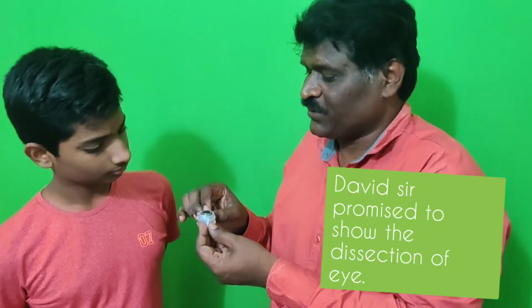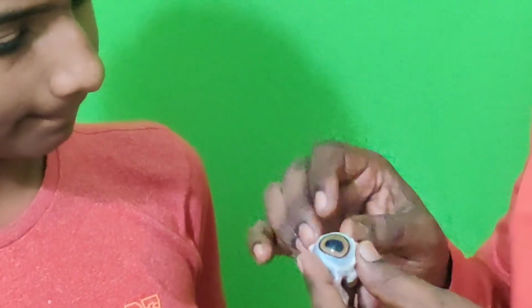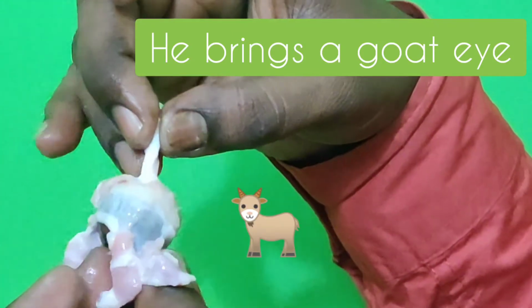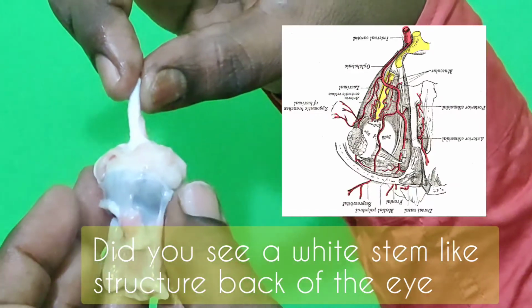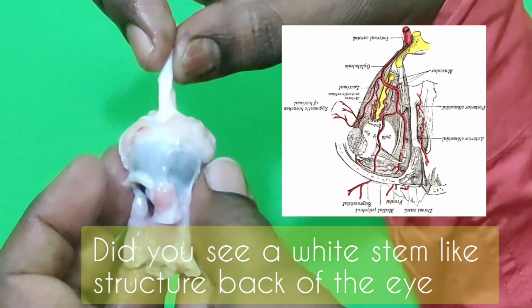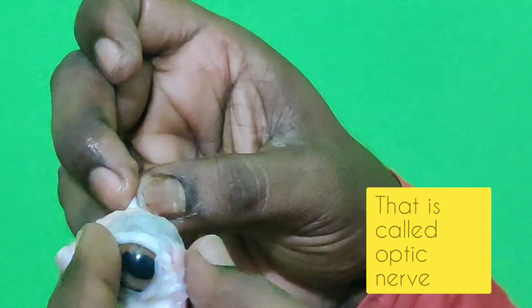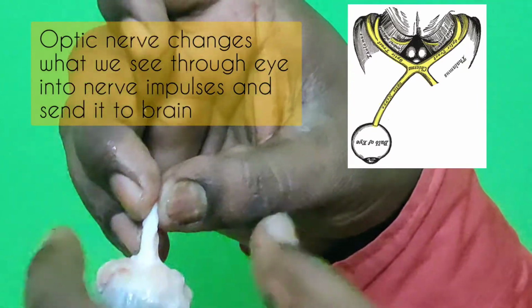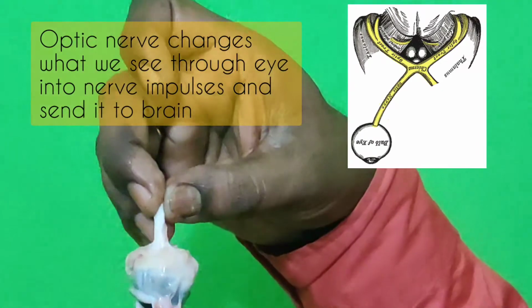David sir promised to show the dissection of the eye. He brings a goat eye from a nearest mutton shop. Did you see a white stem-like structure at back of the eye? That is optic nerve. Optic nerve changes what we see through the eye into nerve impulse and sends it to the brain.